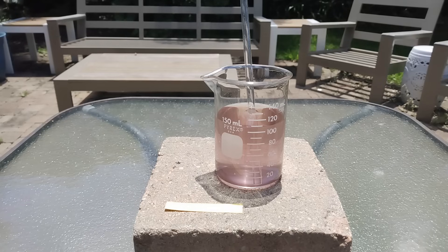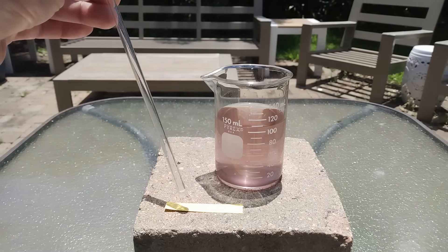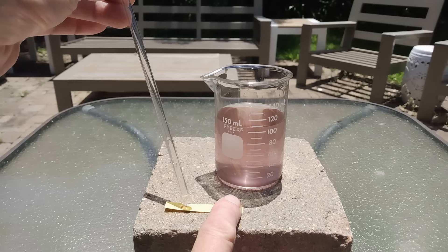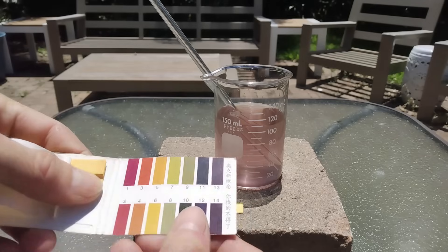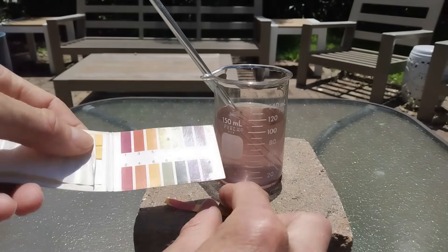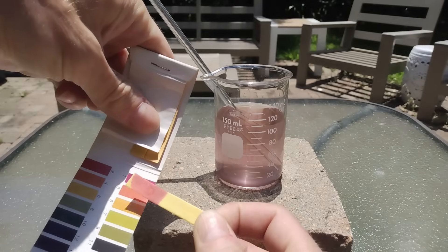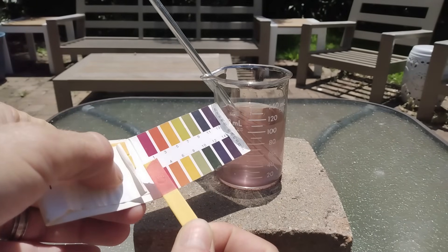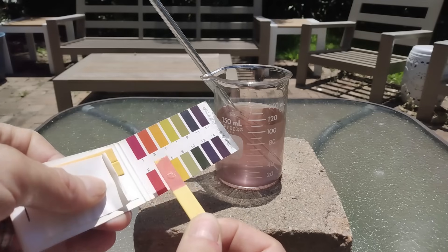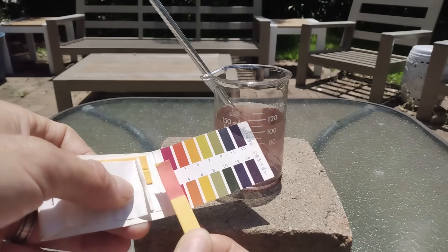So first let us check that it is acidic. Let me put a drop on this paper. Yes, we have a nice red color. Not sure if it's pH 1, 2, 3, or 4 — it's hard to tell — but definitely it is acidic.